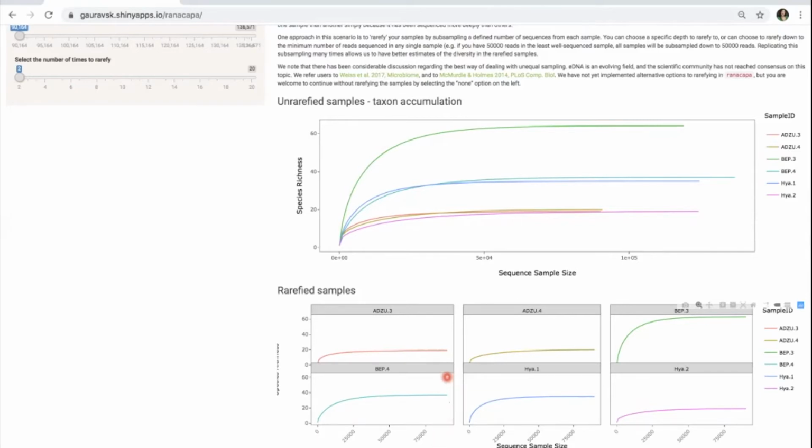And that means that we wouldn't be able to be confident that we can accurately determine the diversity of this sample, because the software keeps finding new bacteria, and 90,000 sequences isn't enough to truly estimate the diversity of that sample. That's what that would mean.